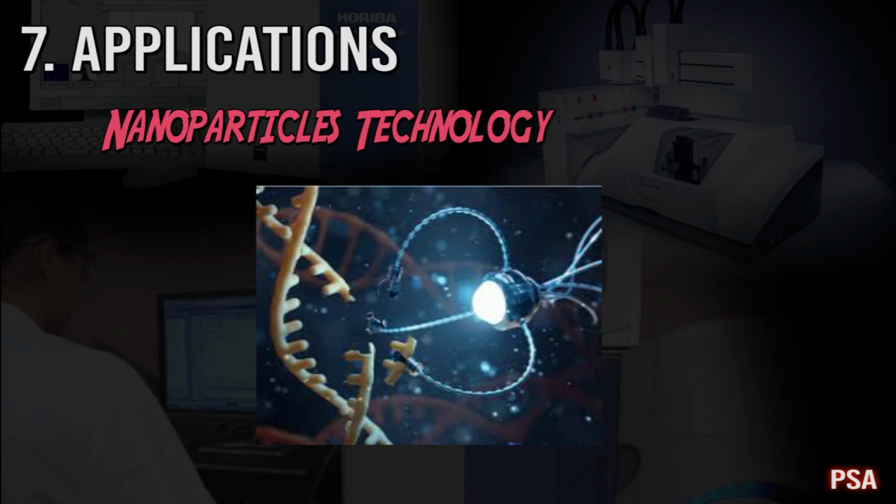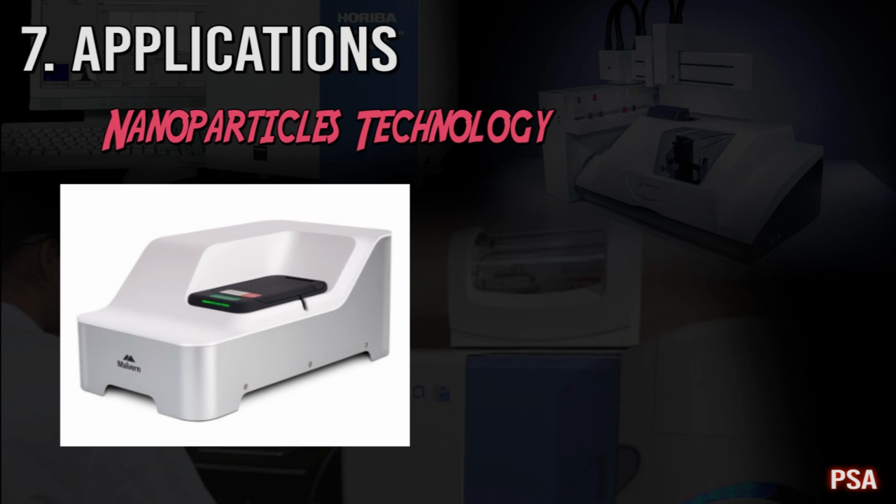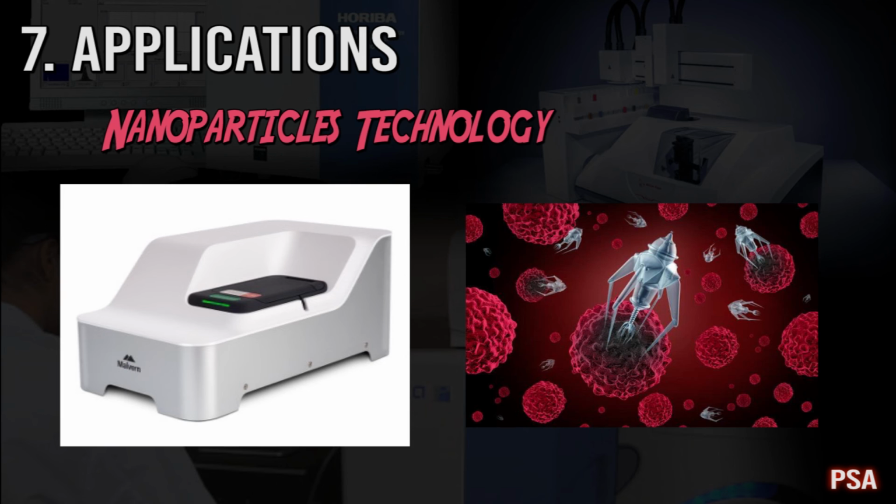Nanoparticles technology. The study of nanoparticles technology nowadays creates a wide range of benefits as a result of its special characteristics related to their sizes, wherein numerous prospective benefits for health and the environment are offered by nanotechnology. The particle size analyzer is used as an extremely important tool for developing methods to maintain good dispersion characteristics by ensuring contaminants and aggregates are identified and screened out.